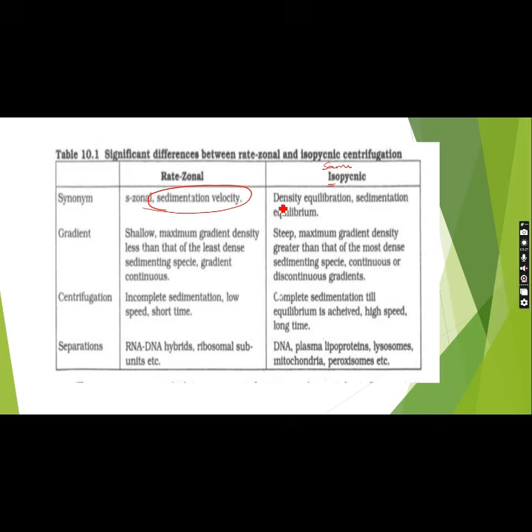So based on the density equilibrium principle and the sedimentation equilibrium principle, it's going to be separated. That means sedimentation at the equilibrium, and based on the density equilibrium, that means at the same density and same sedimentation, it's going to be sedimented off.